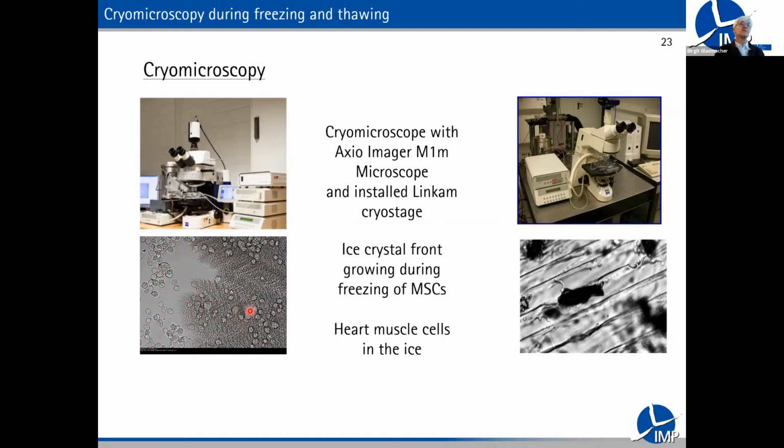It's a very nice method to really see what happens during freezing, although of course this is in a thin layer of the cells in the cryomicroscope and not a real, of course, 3D volume that we need to freeze in daily life. But you get a lot of information and you can really see what you do with the cells.